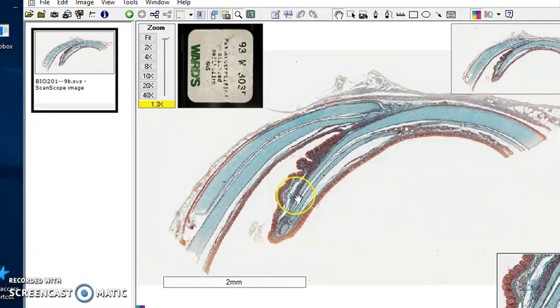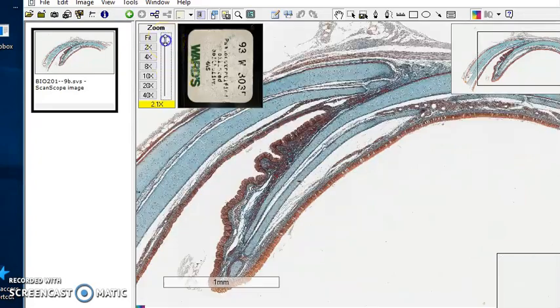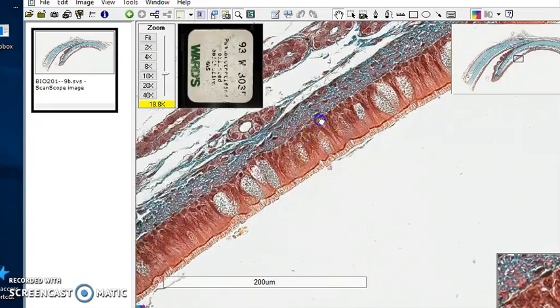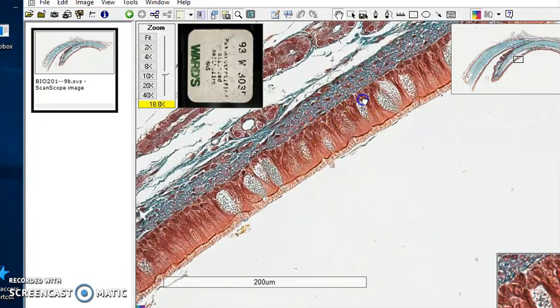The trachea is a classic place to see pseudostratified ciliated columnar epithelium. And you can see from here there are several layers. Undoubtedly, there are different tissues, and we need to zoom in a little bit, increase the magnification to get a good look at that.